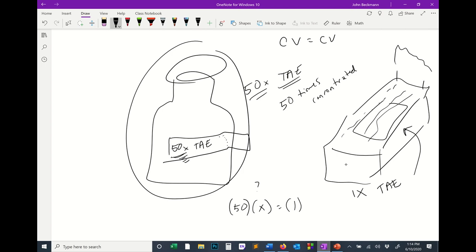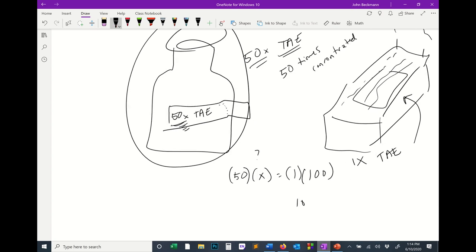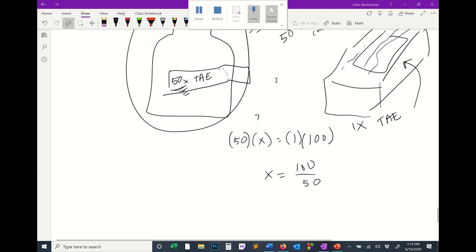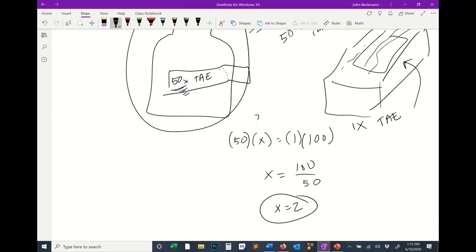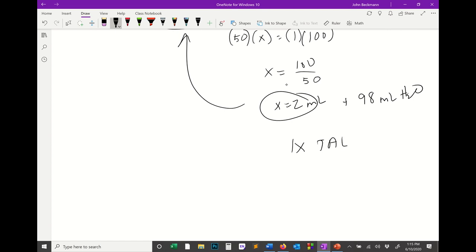One times concentrated solution, so you're diluting it. Let's say we want to make 100 mils. Then you would do this calculation: 100 divided by 50 is equal to x, which is equal to 2. So that formula tells us that we would need 2 mils of our 50x TAE plus 98 mils water to produce a working solution of 1x TAE.